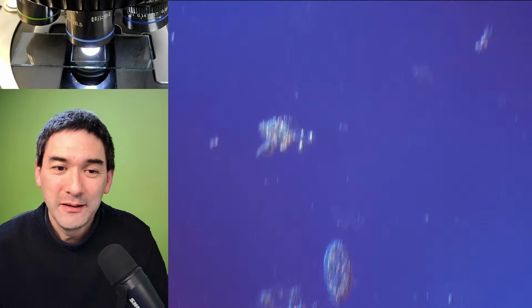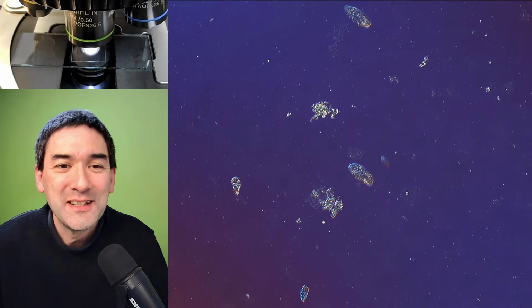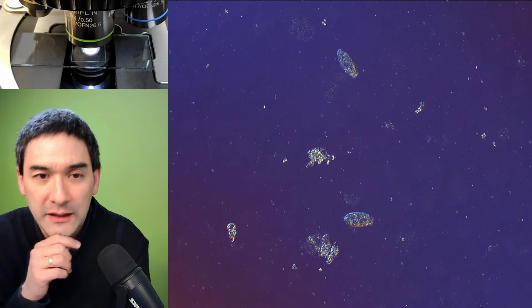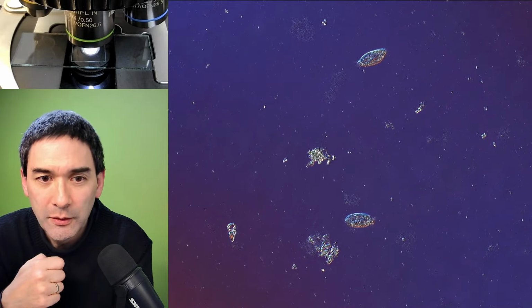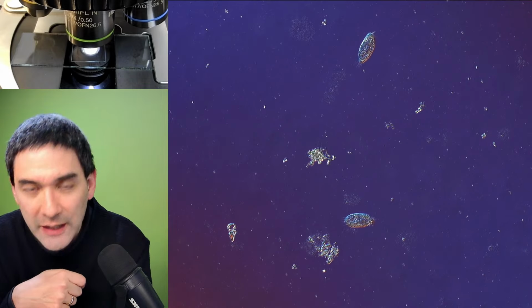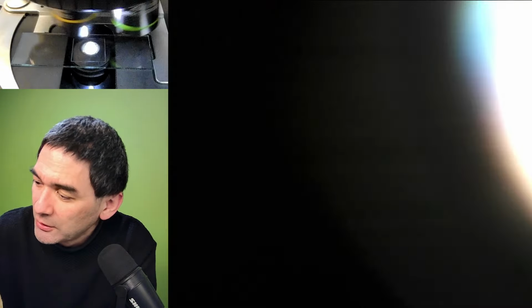Okay, didn't expect this. Now we've also seen a cell division, right? And that's essentially one of the things. If you want to observe these things, I highly recommend those enrichment cultures, because then, of course, they reproduce in there. But I just also want to mention, please observe hygienic standards, because as you can see in the background, plenty of bacteria.